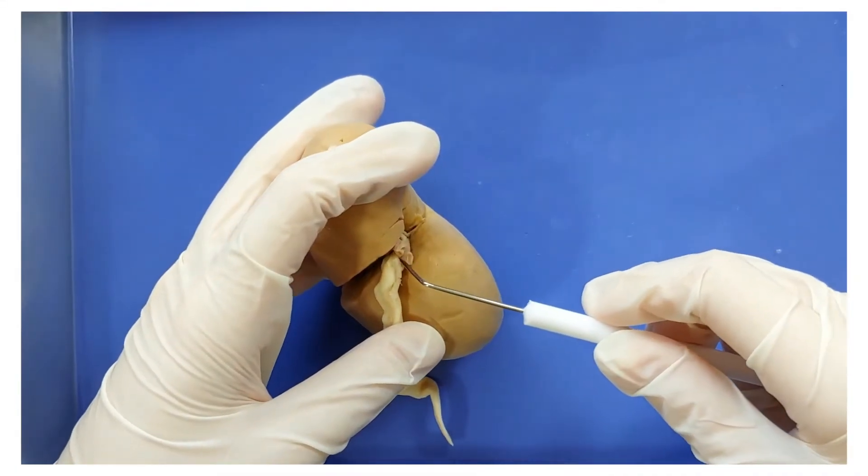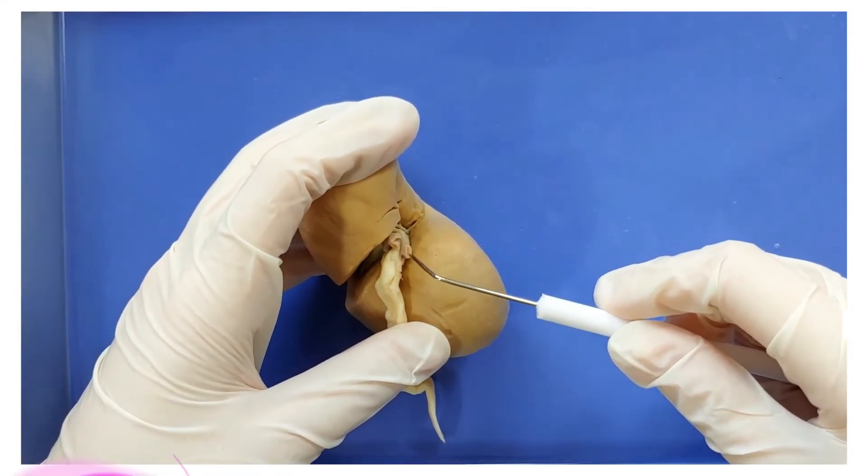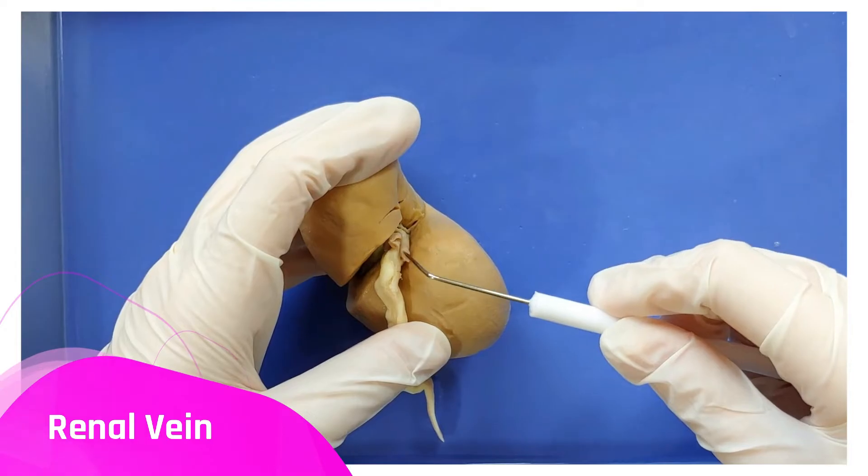Looking at these other two, the thicker one is the renal artery, which takes blood into the kidney, and the thinner one is the renal vein, which carries blood out of the kidney.